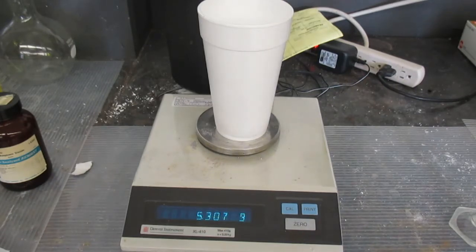Instead, what we're going to do is take magnesium and react it with HCl to produce magnesium chloride. That will be one reaction. We'll determine the heat of that reaction. The second reaction is we'll be taking magnesium oxide and reacting that with HCl to produce magnesium chloride and water. And then the third reaction, which we're not going to do, we're just going to take the value from literature: 1 mole of hydrogen reacting with 1/2 mole of oxygen to produce water. We're simply going to be using the heat of formation for water.